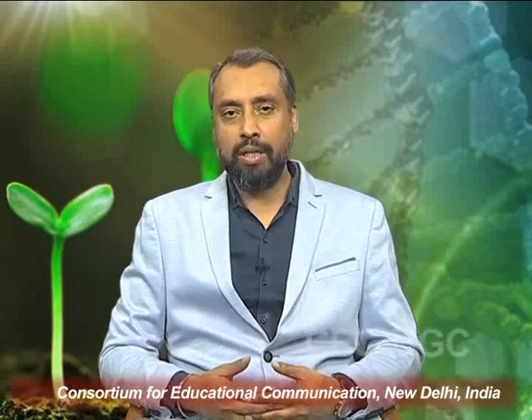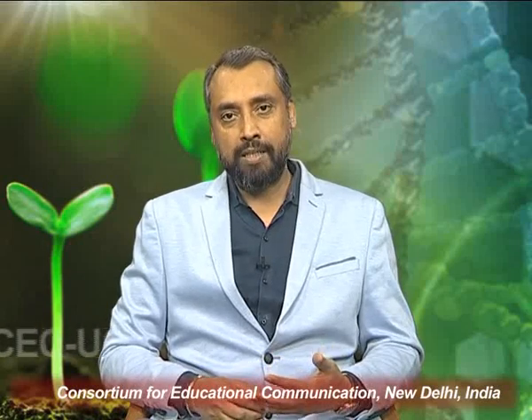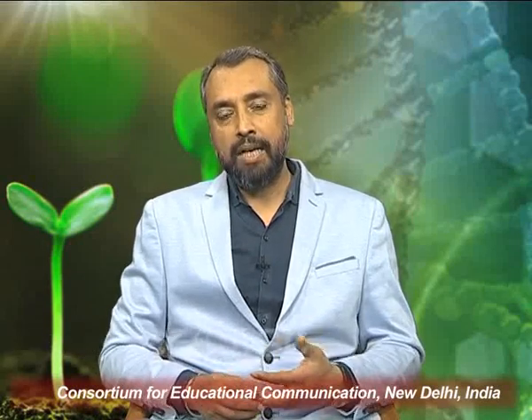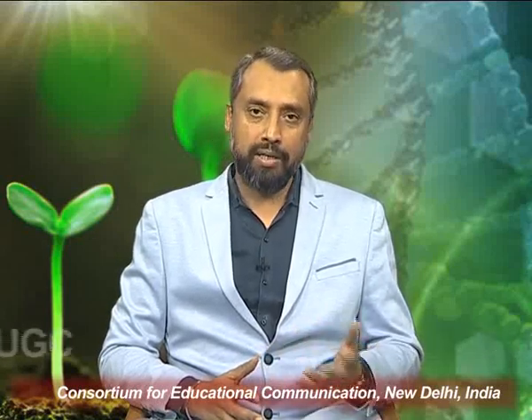So whenever we want to work on a live material, we want that there should be no external contamination affecting our sample or affecting our results. And to achieve that, we also need to ensure that our glasswares, our equipments, our chemicals, are absolutely free from unwanted microorganism or any biological contaminant.